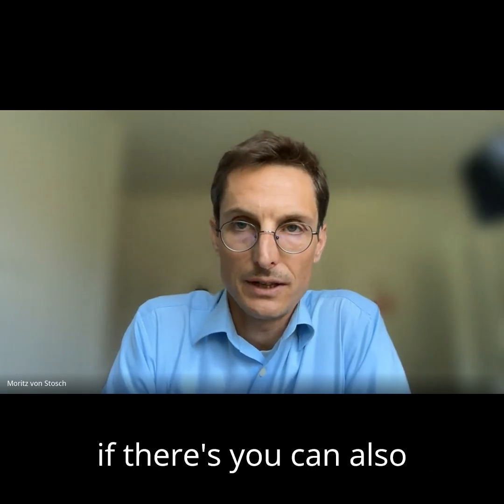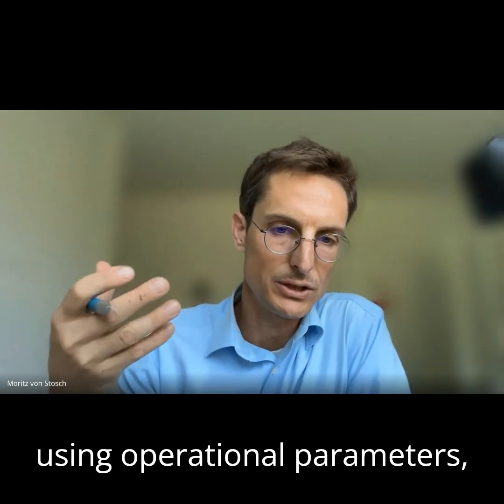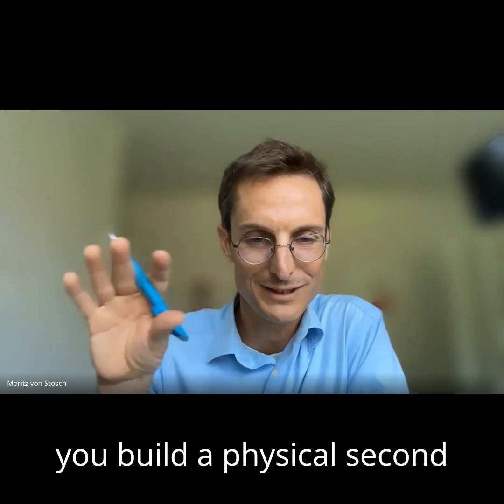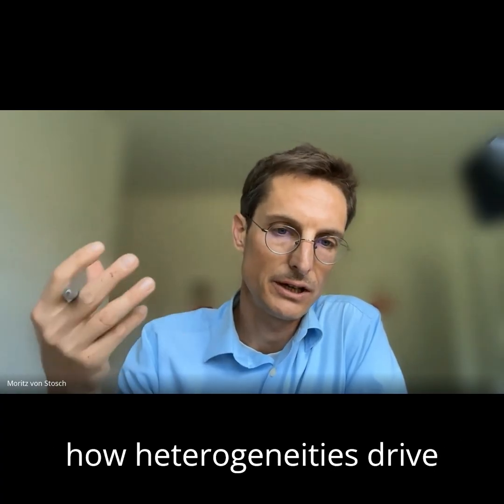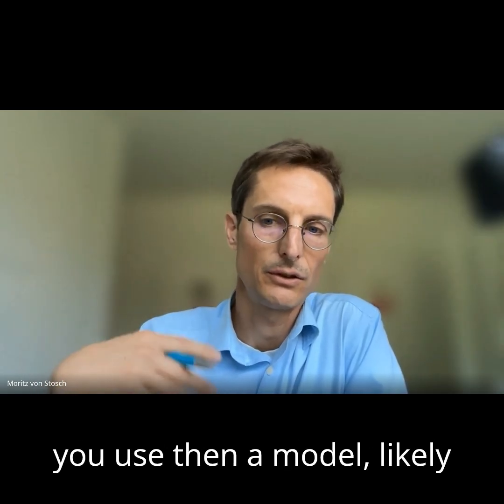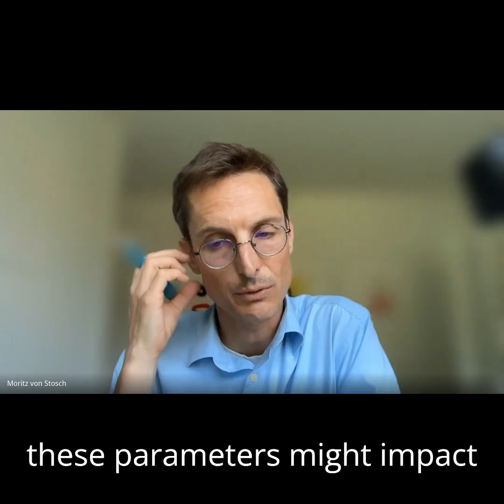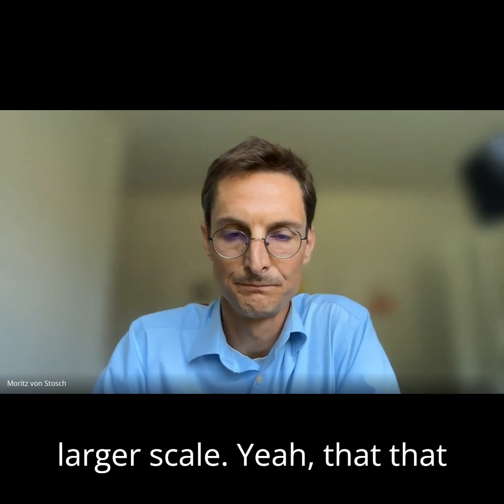Again, I think you can also emulate these heterogeneities using operational parameters, for instance, stirring rate or gas flow, which might not be entirely the same thing as building a physical second reactor, but at least it will give you an understanding of how heterogeneities drive your performance. And so if you characterize this well, if you have the data and use that in a model, likely you can use that to also gain insights on how changes in these parameters might impact performance at the larger scale.